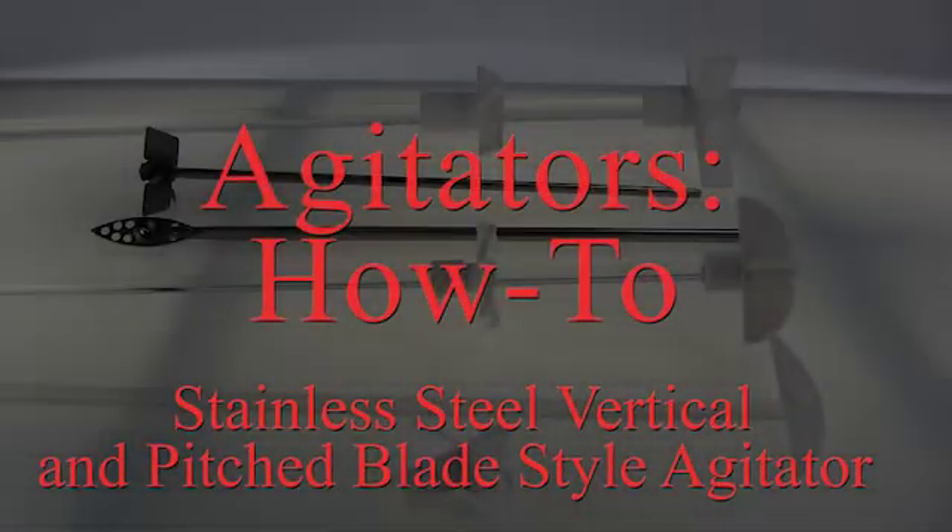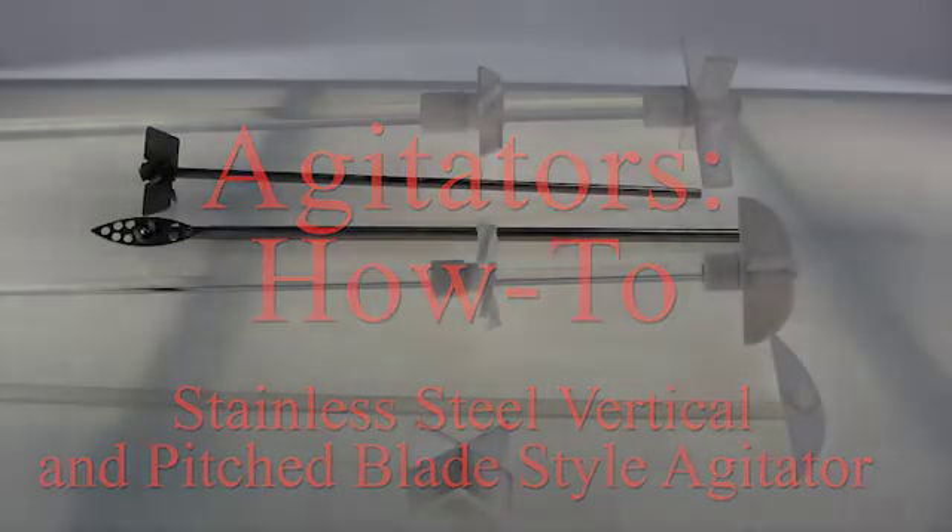Today we are going to look at five different stir shafts and how to attach some agitators to them.